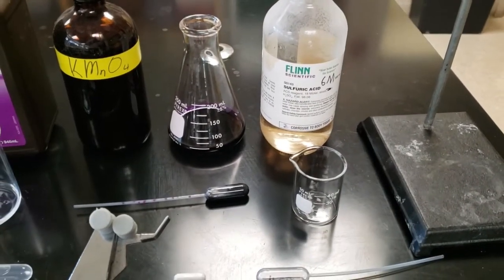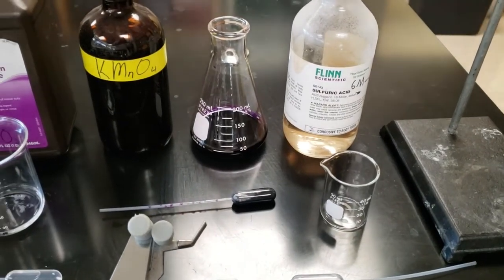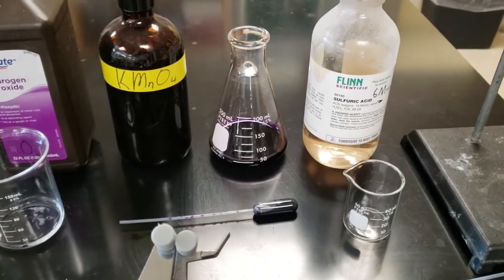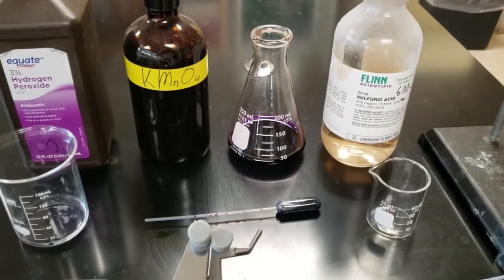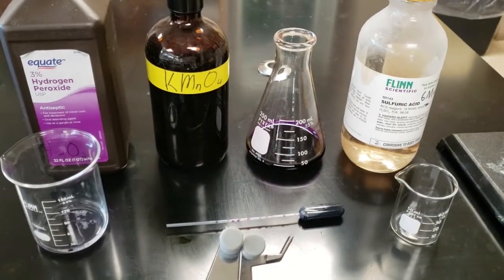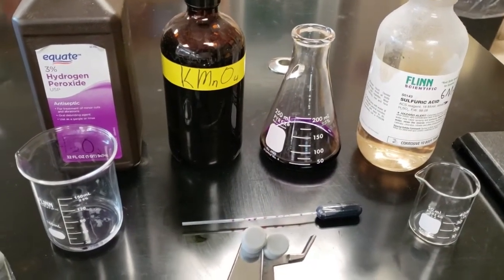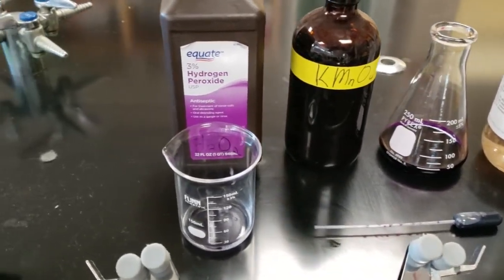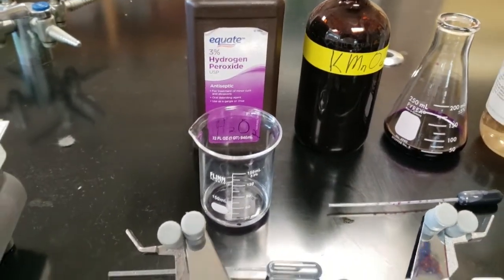There's the 6 molar sulfuric acid. We need to use that in excess for the reaction to happen and to keep the manganese from becoming manganese dioxide. We're going to pipette in 5 milliliters in this case.